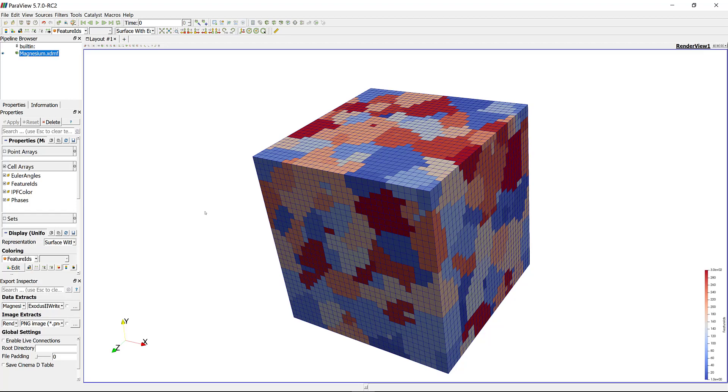If you use a coarser mesh, it will interpolate grain ID for larger elements, but if you use a finer mesh you're still fine. In this session, I showed you how you can generate microstructure from your EBSD file using the synthetic microstructure generator of DREAM.3D through the pipeline we developed for PRISMS Plasticity. In the next session, I'll go over some of the more advanced features of PRISMS Plasticity. Thank you.